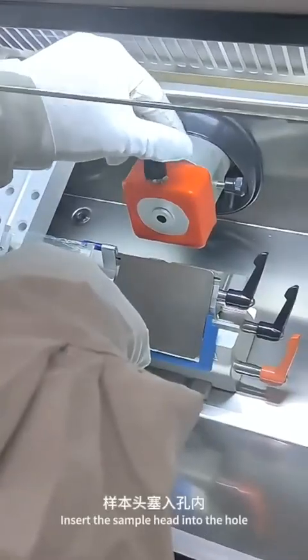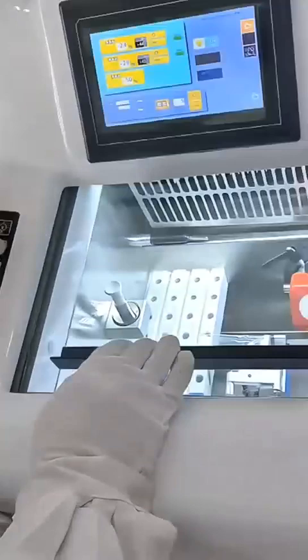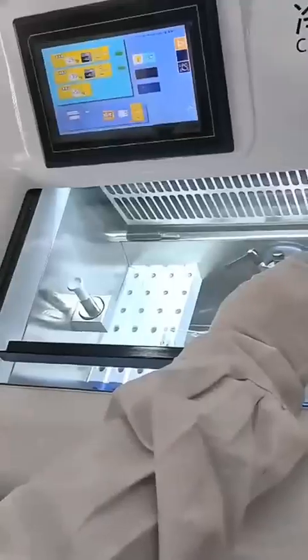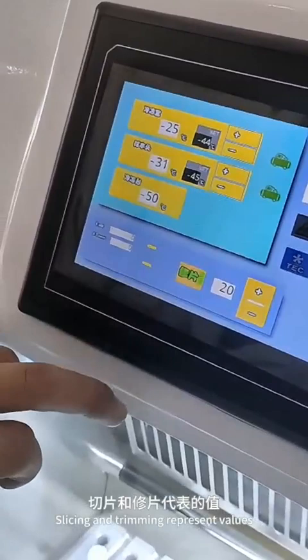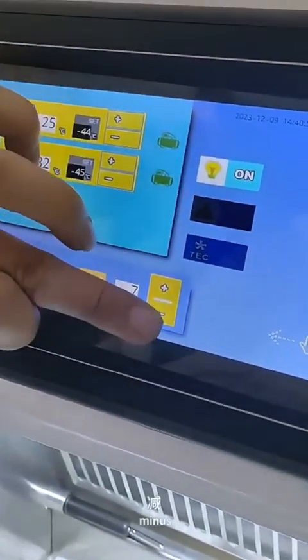Insert the sample head into the hole and tighten the knob lock. The lamp, ultraviolet, forward, fast forward, fast backward, slicing, and trimming functions represent values — 20 represents 20 microns, and slice represents 5 microns. Plus and minus adjust these settings.